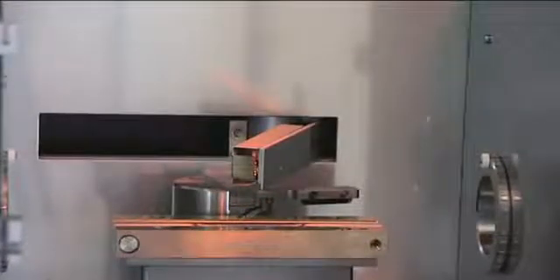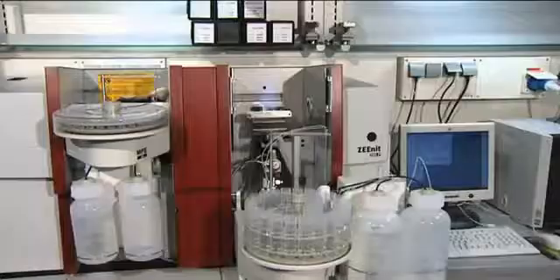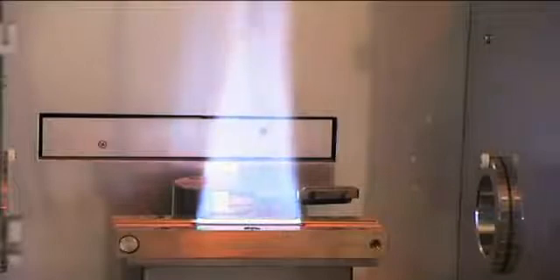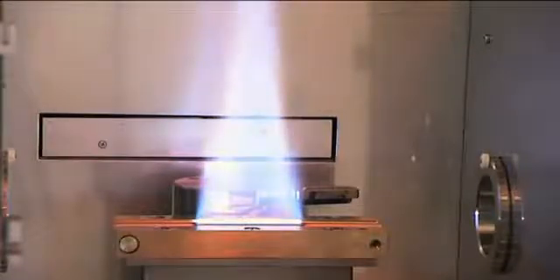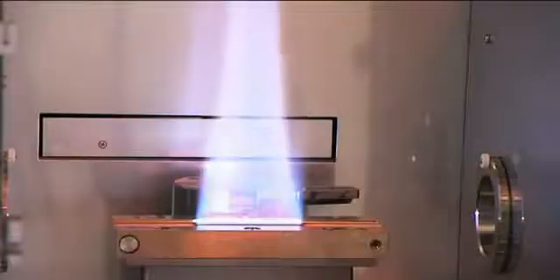The flame atomizer was optimized for robustness even with respect to difficult sample matrices. The titanium burner head with a slot length of 5 or 10 cm is exchanged easily and recognized automatically by the instrument.